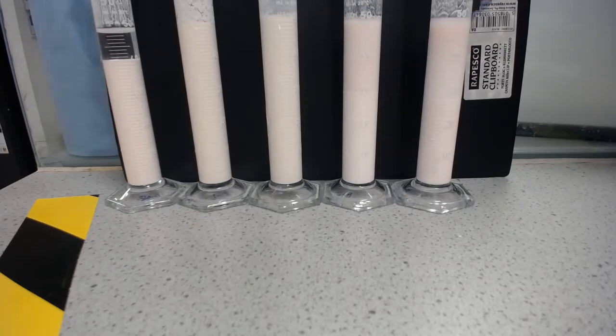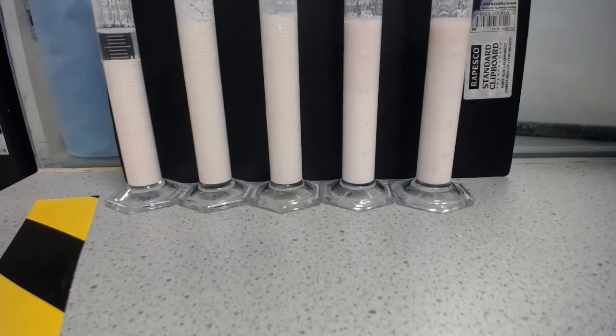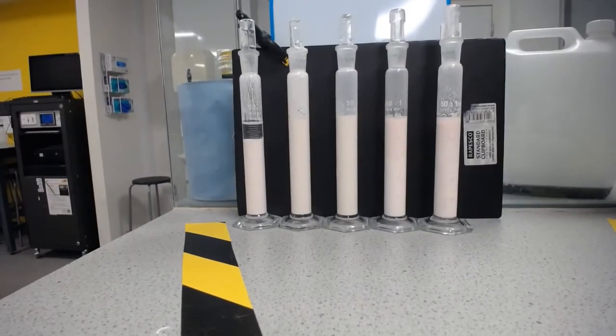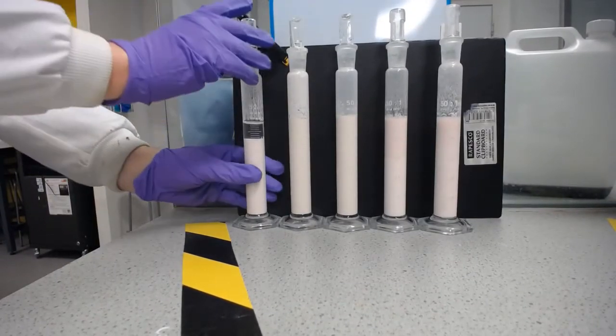So the last thing to check is how many inversions are going to be required for these to redisperse and be homogeneous. So I'm just going to put my gloves on again for this. Now I'm actually going to be touching them. Well, these are pretty safe, as you can imagine, given that it's something that we put on our skin. I'm going to take the first one.